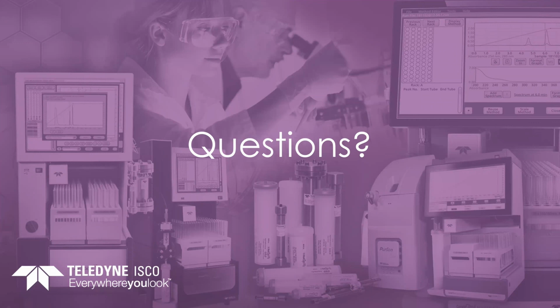Can I use the same column type from different manufacturers? In other words, I use a diol from one company and a diol from a different company on the analytical system. And the answer to that is there is usually a selectivity difference between the columns. So you might get away with it for some compounds, and other compounds will give you a bit of a surprise when they elute differently when you calculate the prep system.